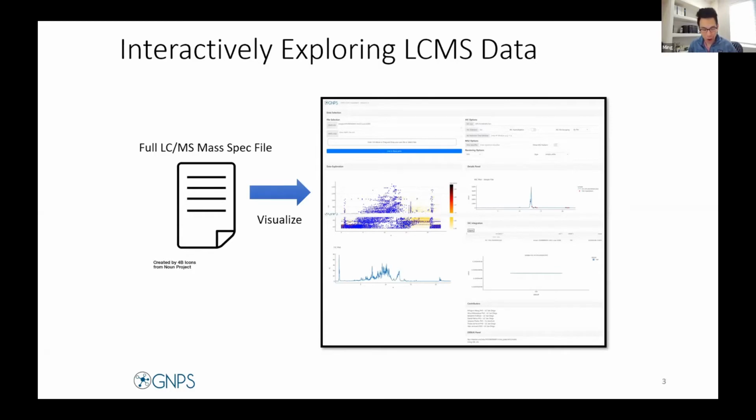One of the problems was whenever we wanted to look at mass spec data to figure out problems with algorithms, or just to get some intuition about what's going on, I really hated downloading the files, number one. I hated converting the files. I hated installing software. I mean, there's sometimes a need for MZmine and tools like that if you're doing large scale data analysis or feature finding. But all I was interested in was looking at a particular peak for about 5 seconds, and spending a couple of minutes prepping to look at something for 5 seconds, I really did not like that.